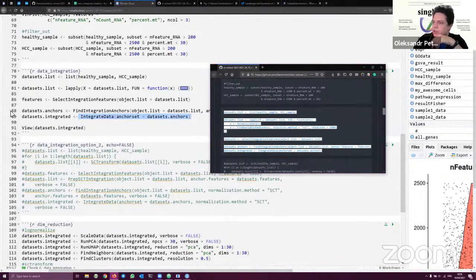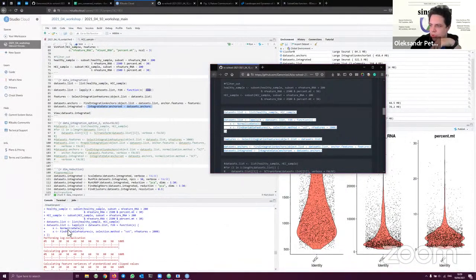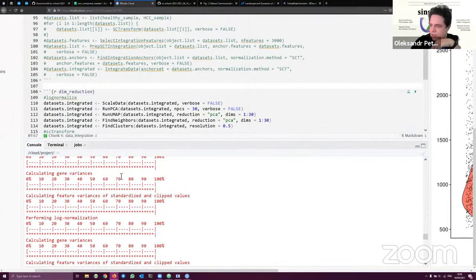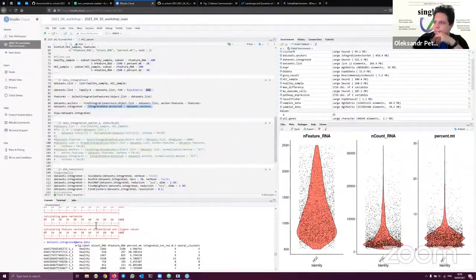So let me see. Right, but did you see this output in the console I'm showing now? These are red lines. Yes, I have those. Yes, the red lines, I have them. What did I do? Then maybe just select these later parts again and execute them again. Okay, I will do it. Maybe you skipped one of the lines, it happens in this case. Okay. So in this case, what else is important?